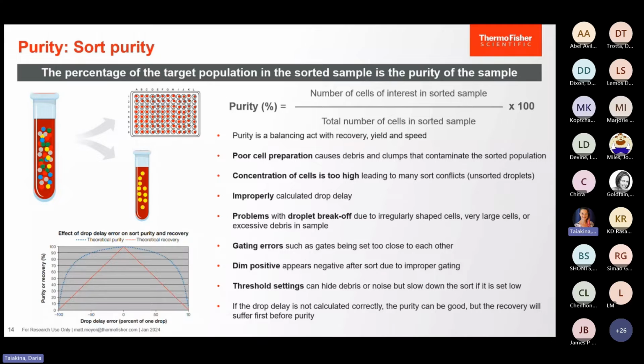For bulk sorting, typically what we use is something called purity mode, and that by definition just can't have a contaminant cell, and is probably your best balance of efficiency, speed, and recovery. We can modify all these sort modes with a custom setting, so you can actually increase or decrease the sort criteria. But purity is something you can remeasure after your sort to confirm that you have a high purity.